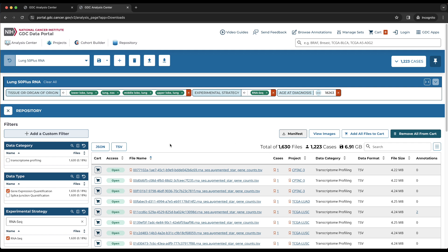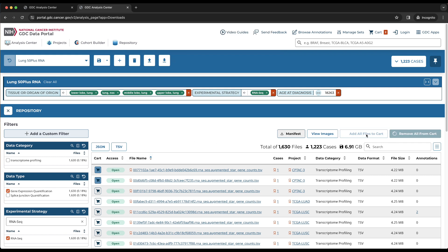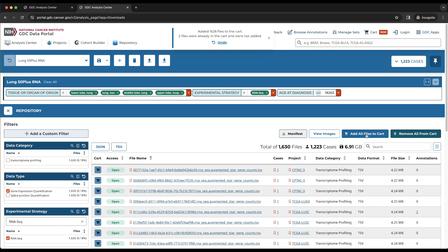Each of the cart buttons at the leftmost column can be used to add them to the cart one by one, but since we have so many files, we will use the Add All Files to Cart button at the top of the table. The cart icon at the very top right of the portal shows a highlighted number, which indicates that 1,630 files are currently in the cart. Clicking the cart icon will bring us to the cart page.